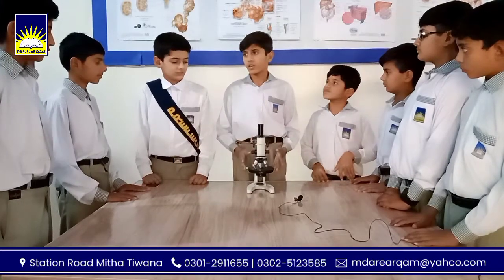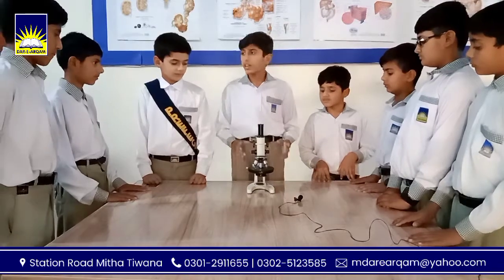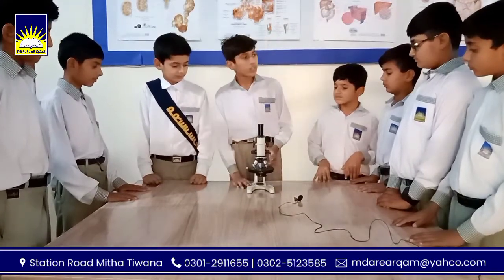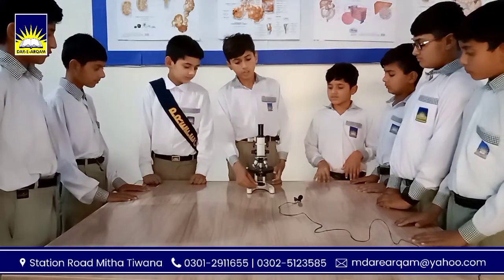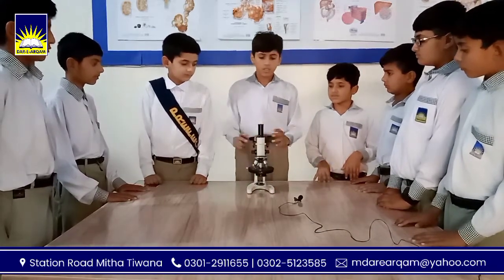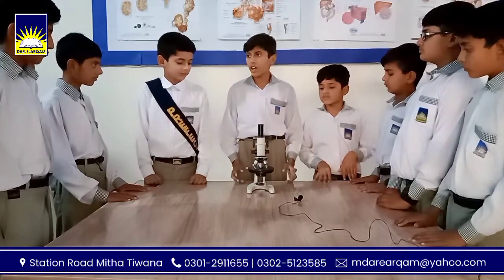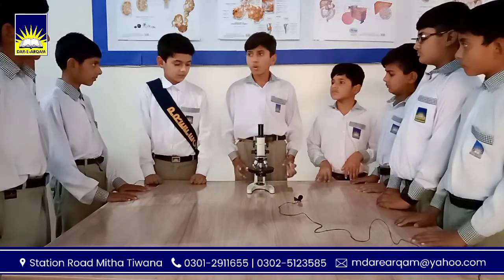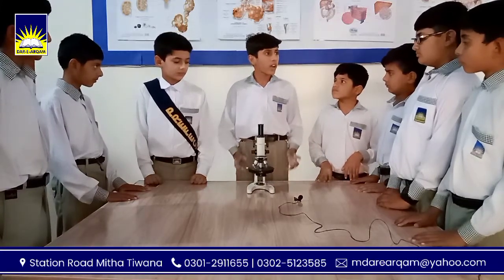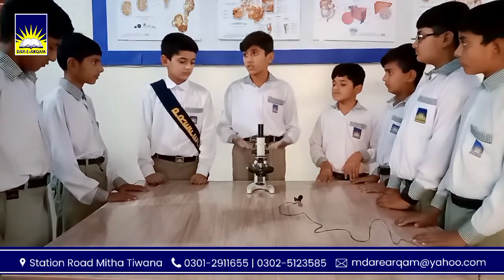So here is a microscope. Now I will tell you parts of microscope. A light microscope has a base, an arm, a tube, a stage, a mirror, and two adjustment screws. The lens at the end of the tube through which we observe an object is called an eyepiece. In short words, through microscope, we can view an object up to 1500 times bigger than its original size.